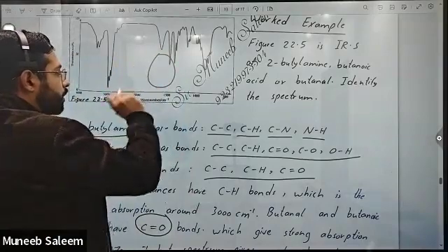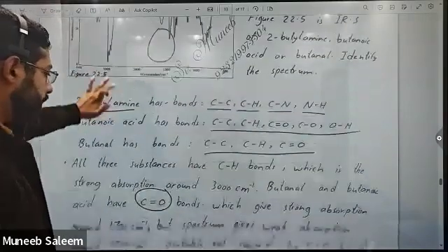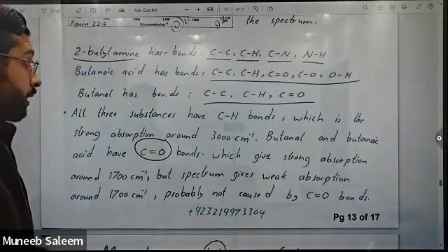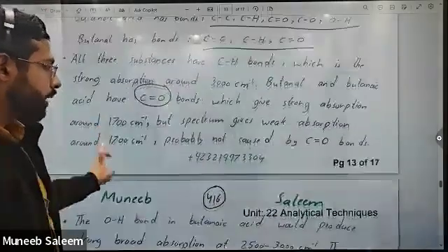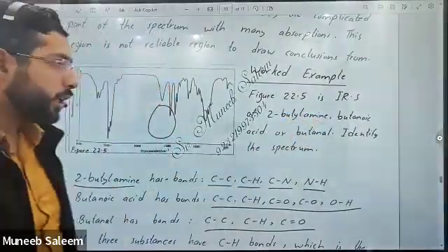There is no peak for a carbonyl group present here.